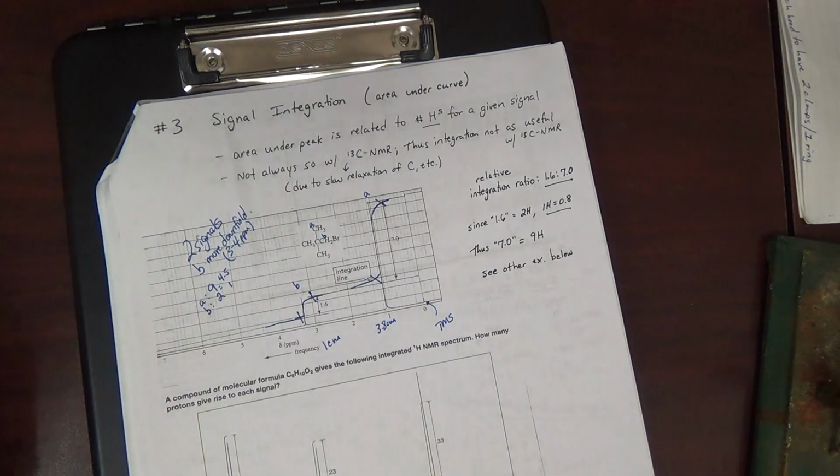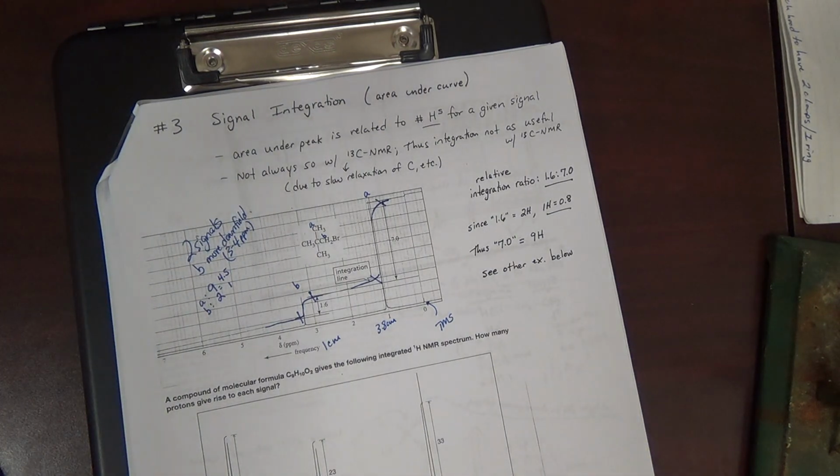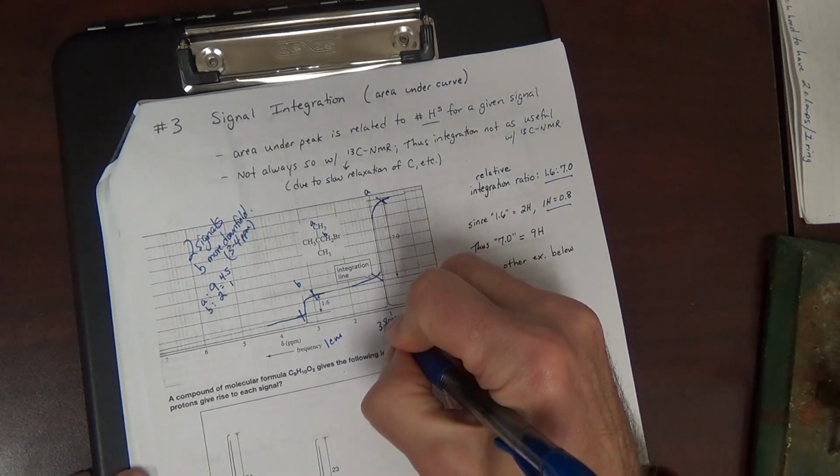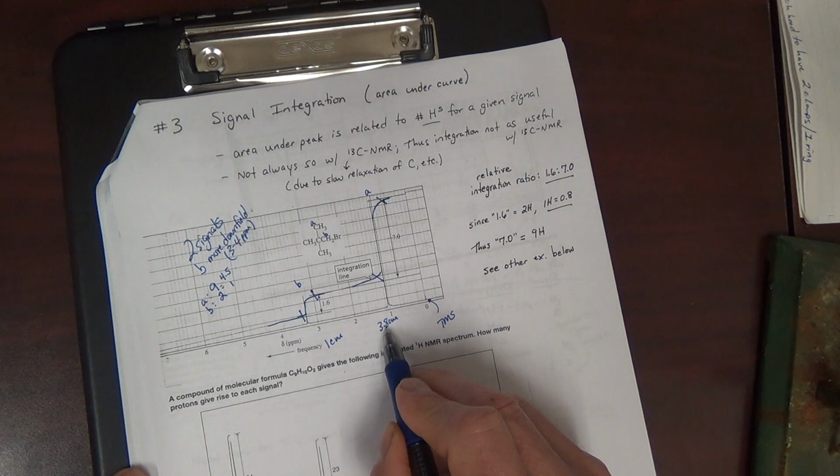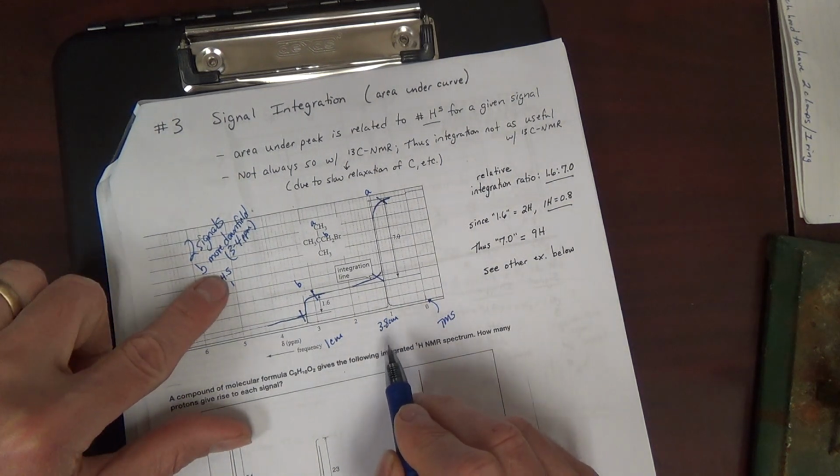All right, that's a little bit off. I'm seeing a 1 to 3.8 ratio. It should be 1 to 4.5.